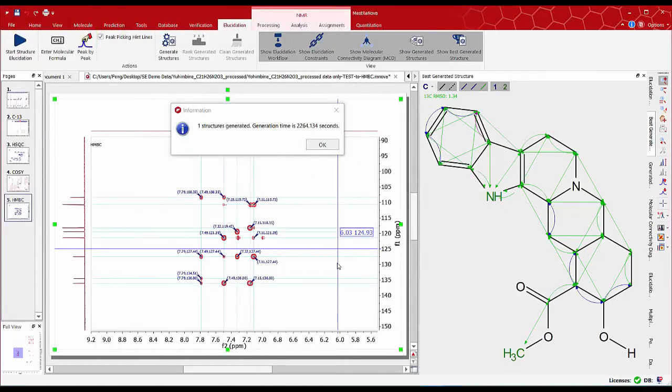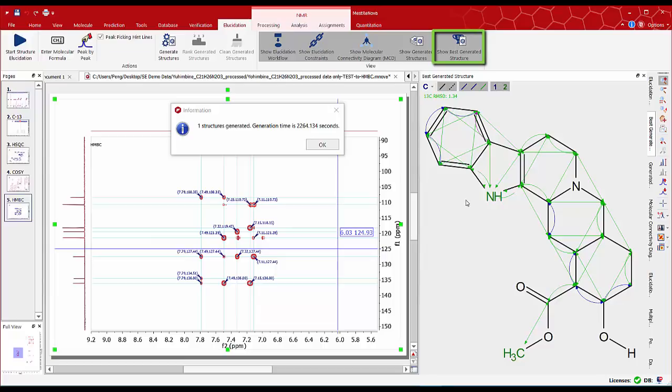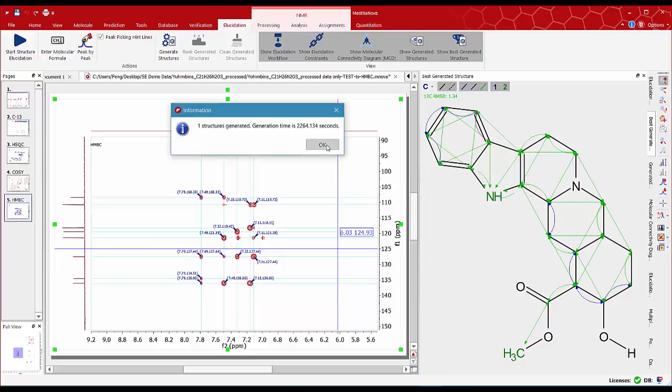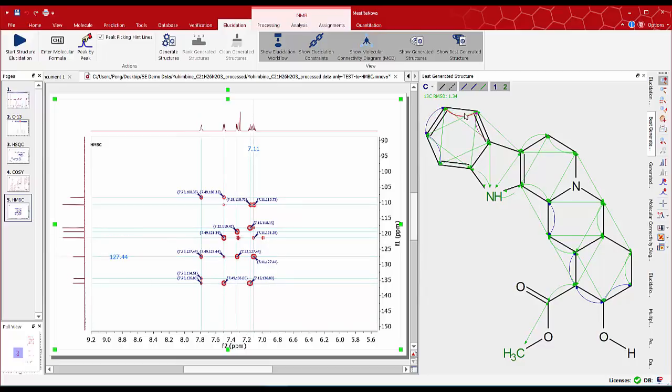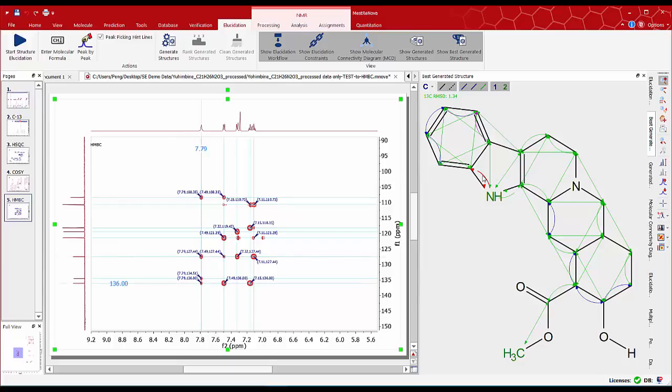After about 40 minutes the structure elucidation was completed. On the best generated panel we can see the structure obtained, the correct one, and the blue curves showing the carbon-carbon one bond connectivities from the COSY spectra. Also the green arrows or curves one or two bond connectivities from the HMBC spectra. If we highlight any of them we will see them display on the actual spectra. On this occasion the structure generation took a long time because we did not select all possible correlations on the HMBC spectra to avoid a mistake.